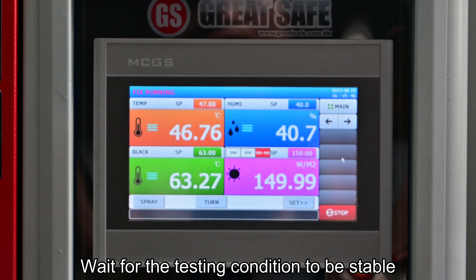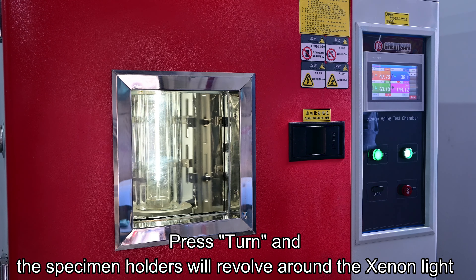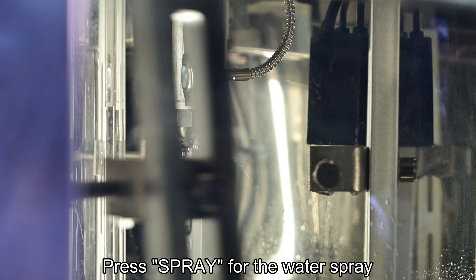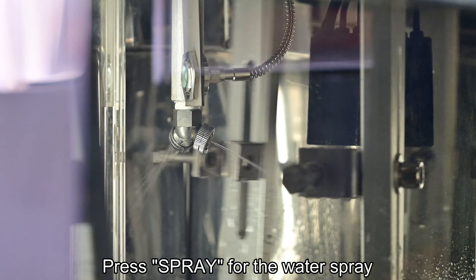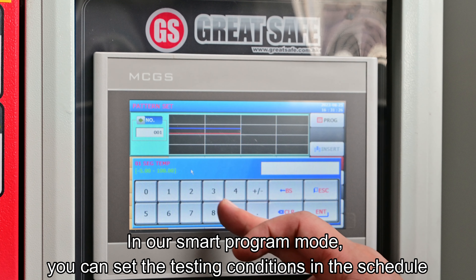Wait for the testing condition to be stable. This is the black panel. Press turn, and the specimen holders will revolve around the Xenon light. Press spray for the water spray. In our smart program mode, you can set the testing conditions in the schedule.